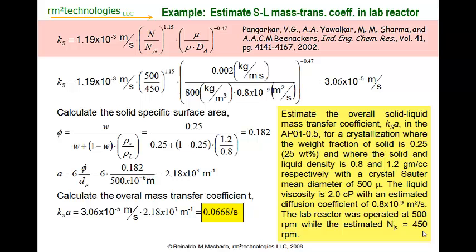This can be used now to compare different scales to understand at what level of mixing we need to get to achieve mass transfer for things such as Grignard reactions or even in crystallizations. It is important to operate just above the NJS and usually not much more. There's no need to overstir solids, and often this leads to problems.